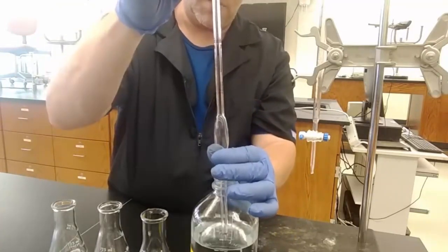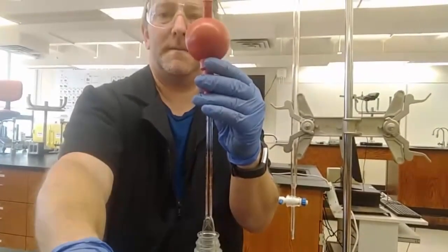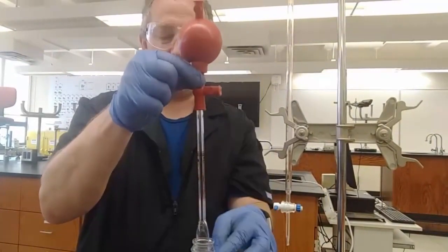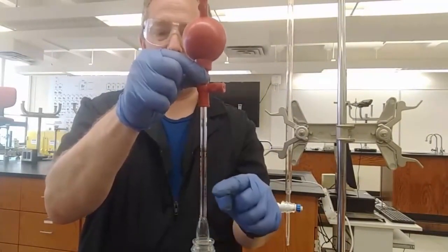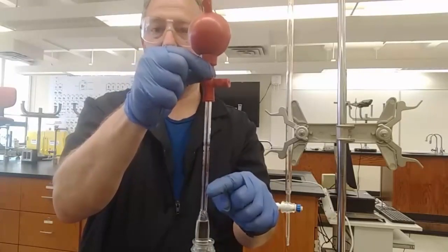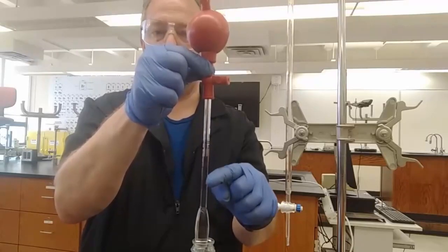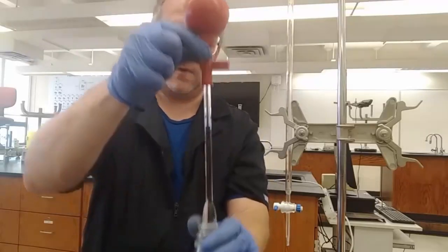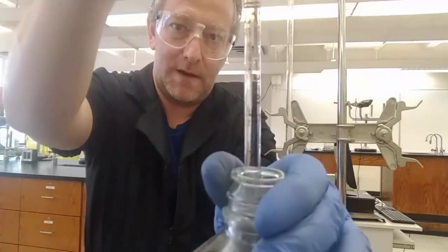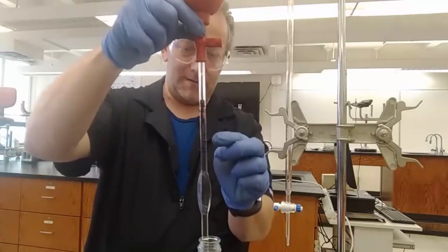And so I'm going to squeeze the top valve to let the liquid suck up into it. And I'm going to let the liquid go in past the line. See it in a second. There it is. But I'm not going to let the liquid get sucked up into the bulb. I've gone past the line, which is down here, but not into the bulb, because that would trash the bulb. I didn't let any air bubbles get in.